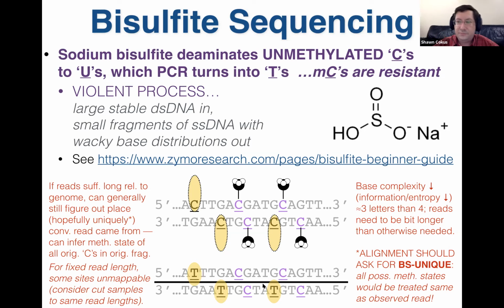In the GA1, GA2 days, we were doing 36 bases and aligning them to human and so on, RNA-seq and whatever. It wasn't as good as it is today, but it wasn't terrible. These days 50 is the shortest people run, and it's even more common around 100 bases. The alignment placement issue isn't really that bad.